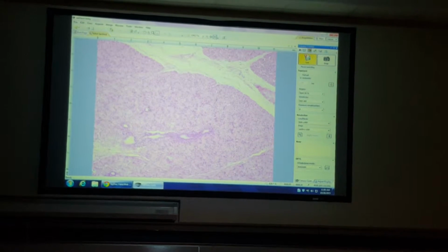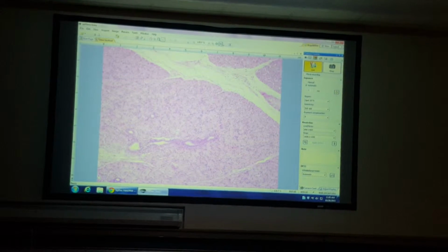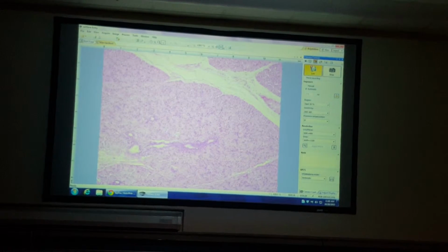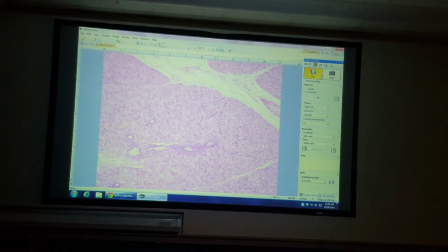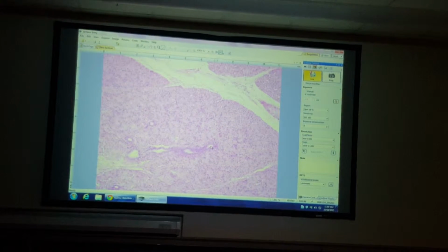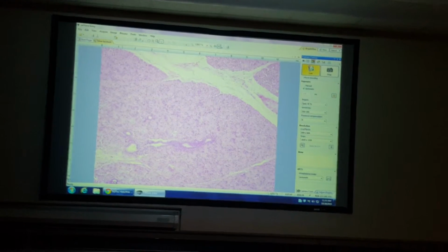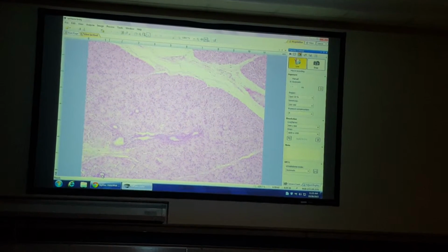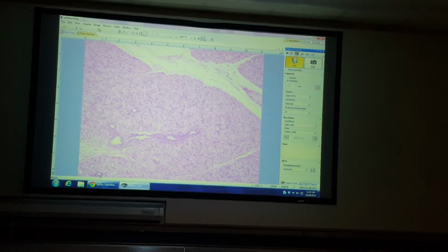Then in here, I can see, oh, there's a ring of cuboidal epithelium. There's a duct. That's a tiny duct. As I come over here, this would be a larger duct over here. Here's a duct cut longitudinally. So the ducts, I should always be able to see the lumen really nicely and be able to see that epithelium on the edges. And the epithelium is anywhere from cuboidal to columnar, depending upon the size of the duct. Okay? There's another nice little duct way down here. So serous acinus, duct. And again, because it's all serous acini, the organ is the parotid gland.